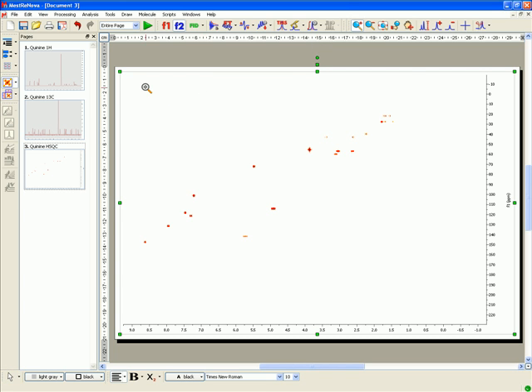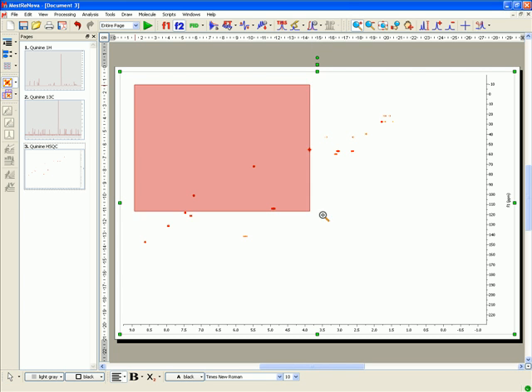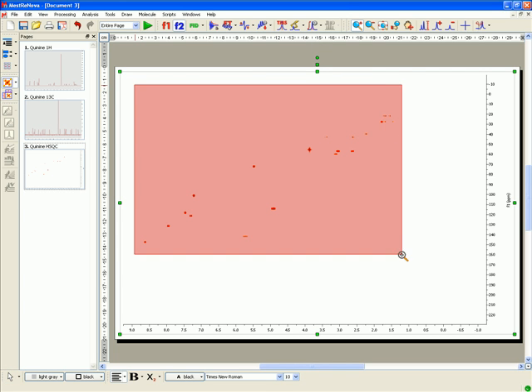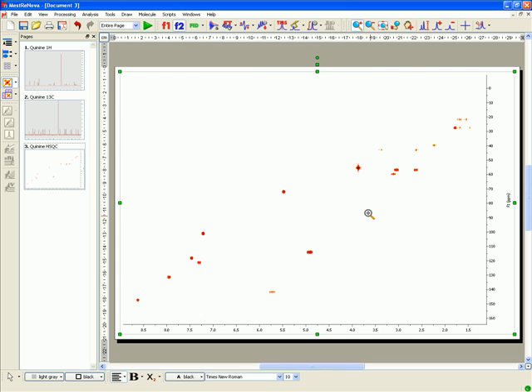MNOVA will select the processing functions for you, FT, Phase Correction, etc. But of course you may change and optimize any of them, and then reprocess the data if you wish.